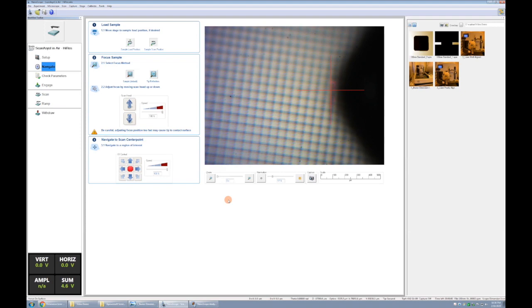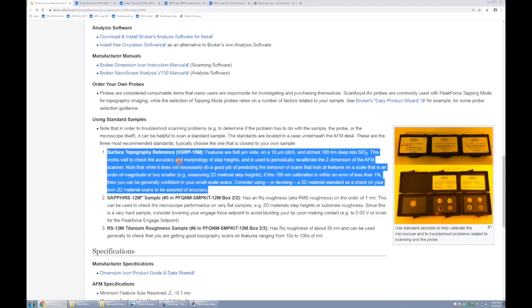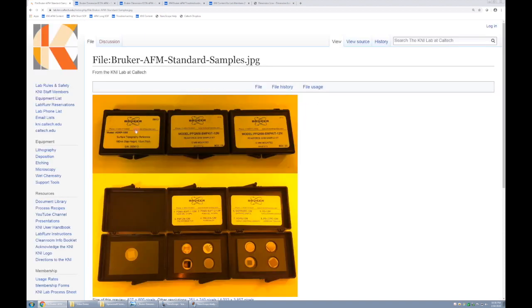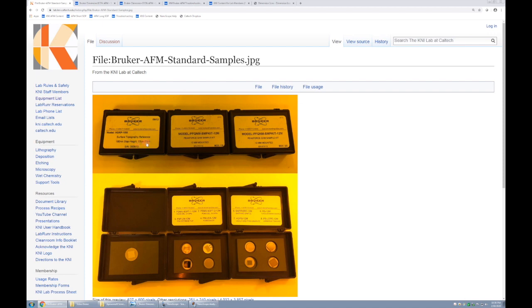To show what we're going to look at today, I'll go back to our wiki page, and we're going to use this surface topography reference VGRP-15M. If I double click on our picture here, we'll see that it's this 180 nanometer step height. These are six by six micron squares etched into silicon dioxide, and they're set on a 10 micron pitch in both the X and the Y.